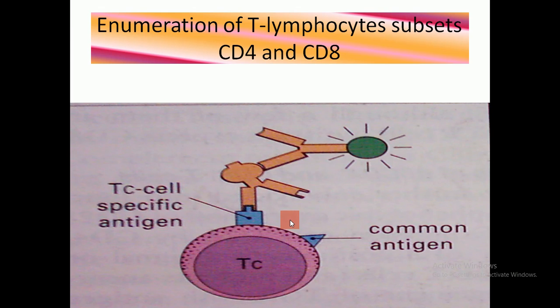We examine how many cells have a fluorescent cell wall and calculate the percentage.